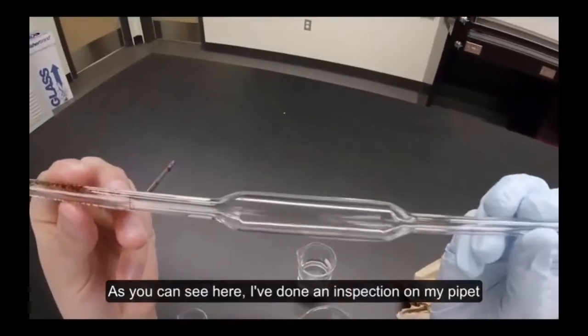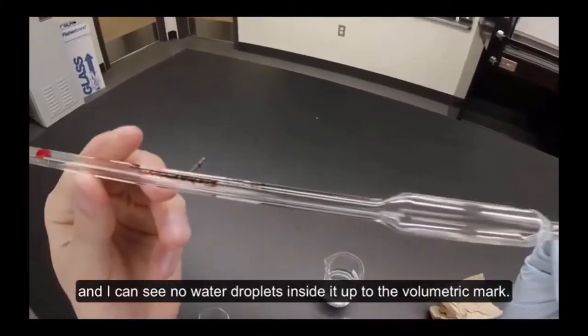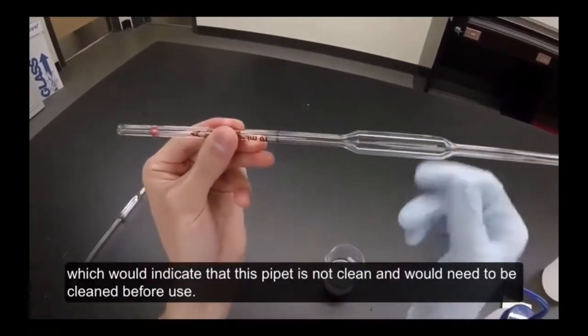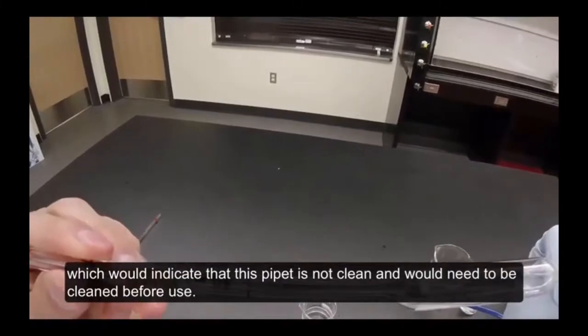As you can see here, I've done an inspection on my pipette, and I can see no water droplets inside of it up to the volumetric mark. In this pipette, we can see water droplets underneath the volumetric line, which would indicate that this pipette is not clean and would need to be cleaned before use.